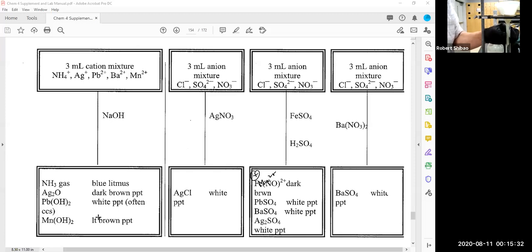Okay, with more quantitative filter paper, it just filters a lot slower, but it captures more. So the tiny particles of precipitate actually make it through here, but they're hard to see, and they shouldn't interfere with much. And so we should be okay. All right, this is slowing down. So since it's slowing down, I'm going to do this. I don't need to capture every drop of it. I have plenty here to test. That should be plenty to test.